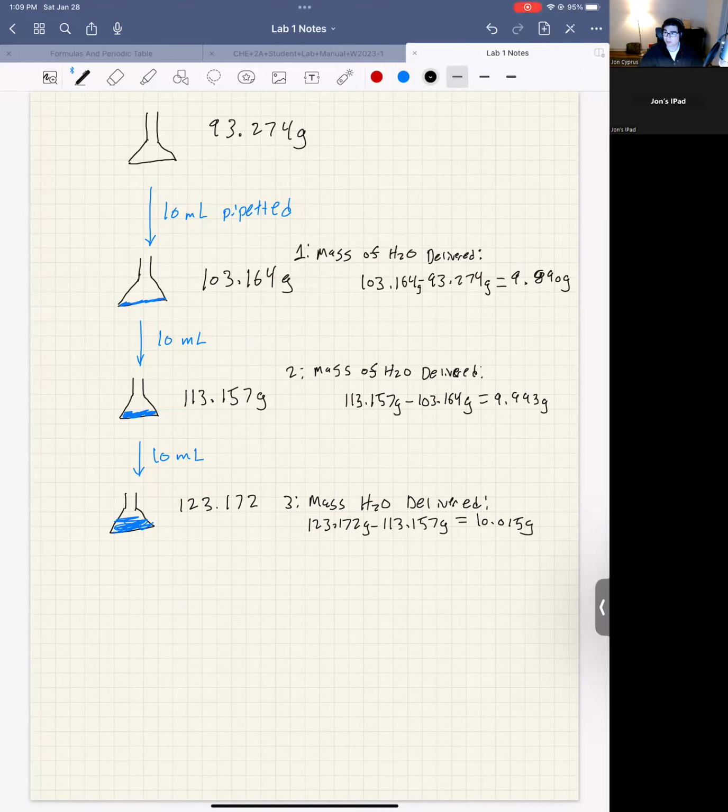or you will get this wrong. Because then you would be doing 20 from here to here and then dividing it by the volume of 10. I've seen this happen, and then getting the wrong density. So now that you've done this, you want to calculate the density for all of these.